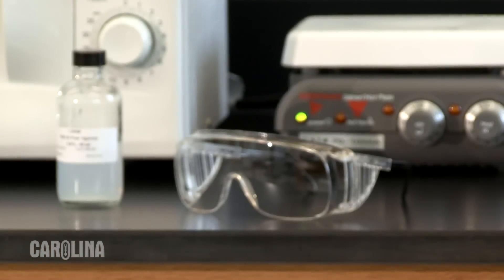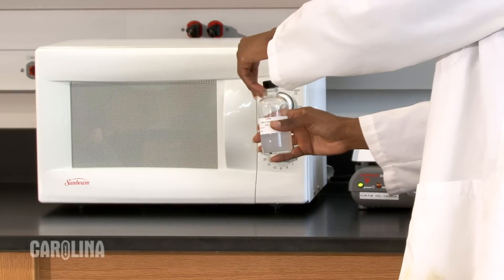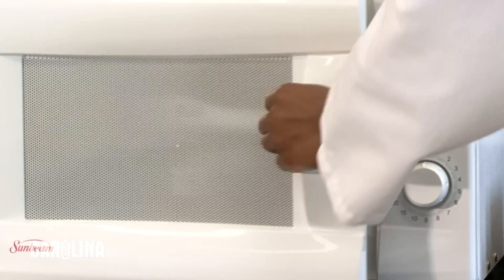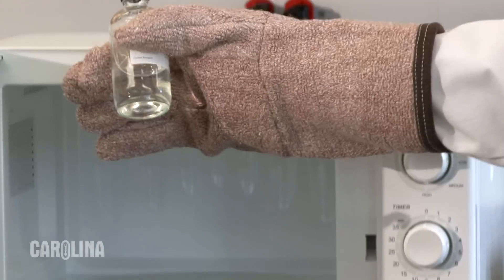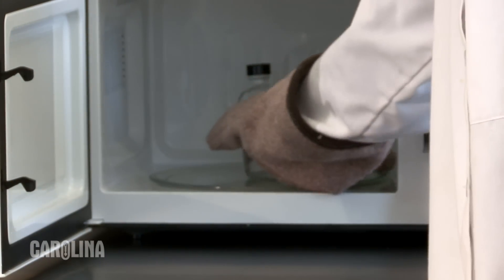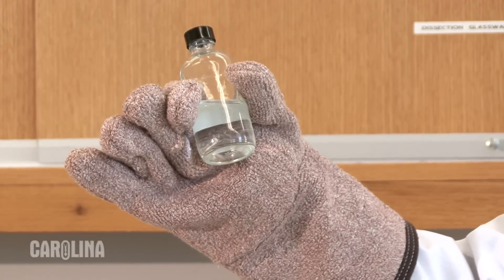Be sure to follow proper lab safety protocol before performing any procedures. The easiest way to melt the agarose is in a microwave. Loosen the cap before you put the bottle in the microwave. Keep a close eye on the agarose and swirl it every minute or so to keep it from boiling over. Depending upon the power of your microwave and the size of the bottle, the agarose should melt completely in anywhere from 4 to 30 minutes.